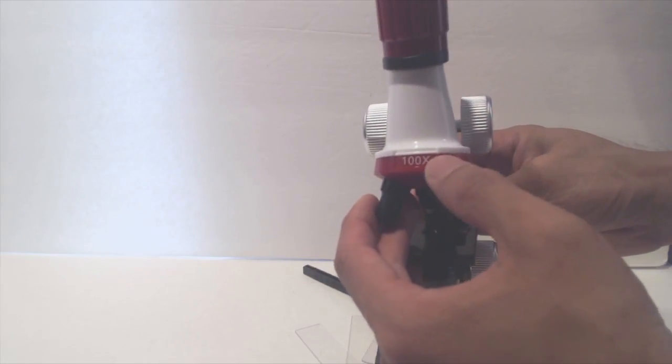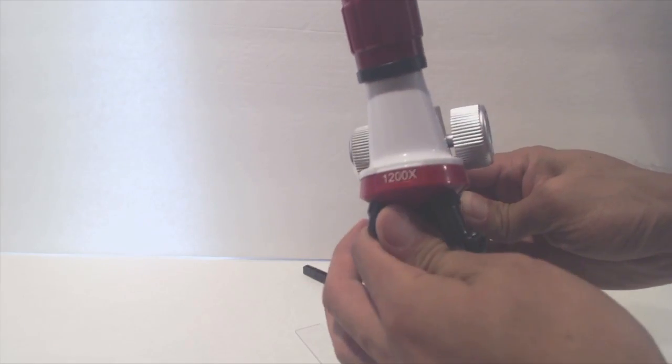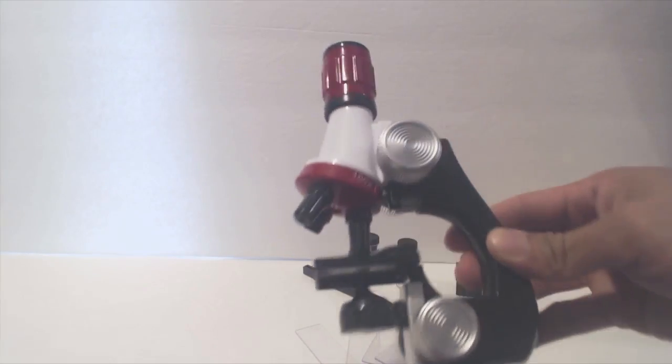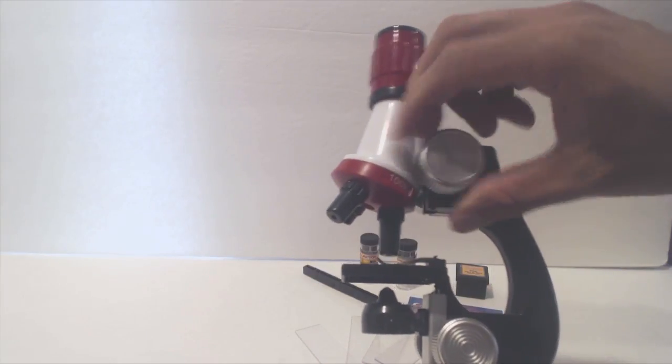The magnification levels are 100x, 400x, and 1200x. To adjust the height and focus of the lens, you'll have to scroll the wheel in the middle.